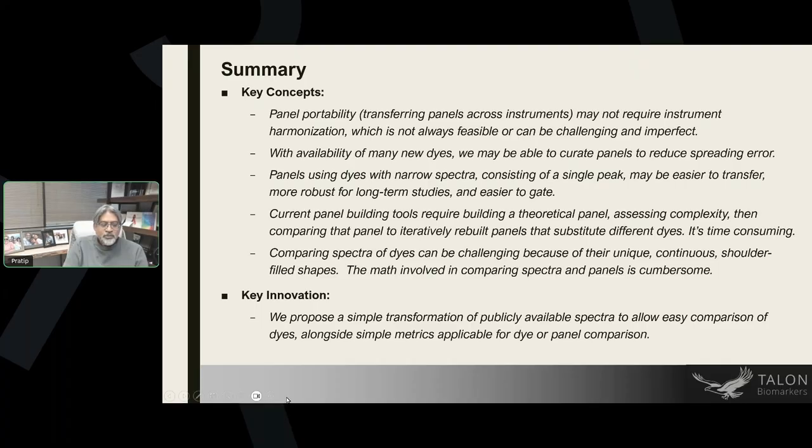So to summarize then, what I've talked about today in terms of the key concepts is this idea of panel portability, transferring panels across instruments. And if you had asked me about this 10 years ago, 15 years ago, I'd say, that's a lot of work, and the first thing you have to do is harmonize your instruments. But a case could be made that if you're transferring panels across facilities that have relatively modern instruments, you may not have to do the difficult process of instrument harmonization, which might not be feasible or can be challenging and imperfect.